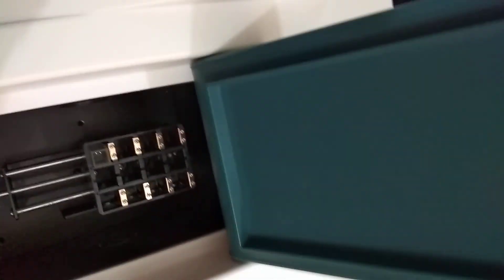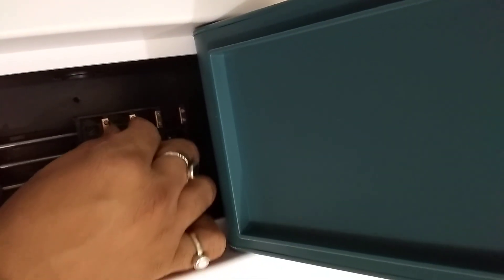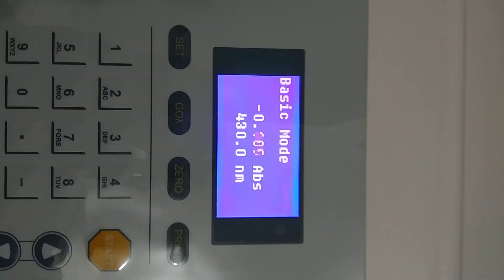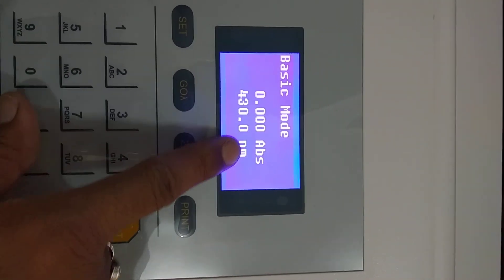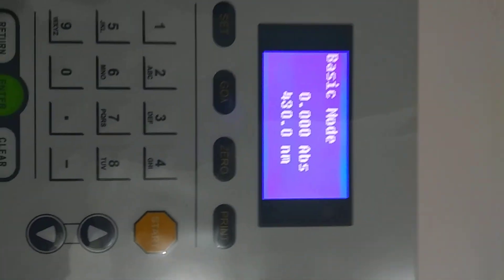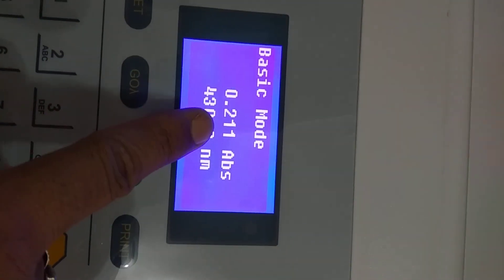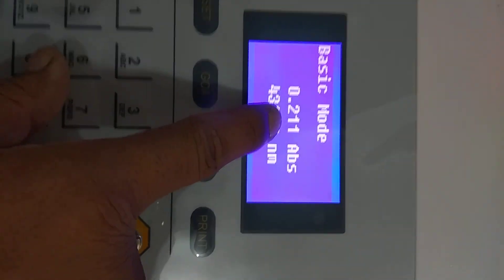The remaining three cells are for your samples. First, input your reference solution in cell one, then place your sample in cell two. Close the compartment, then press 0 for blanking — this zeros the reading on the reference solution. Then slide the cell changer to position 2 and the absorbance reading is automatically calculated and displayed on the screen.